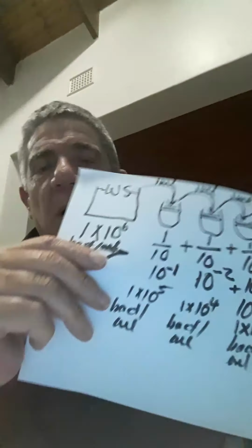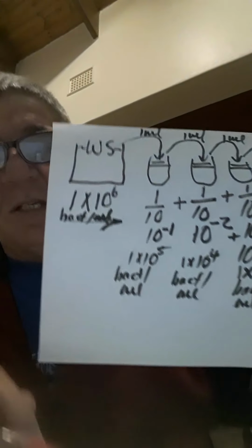Dear class, I'm still on this couple of pages as in the previous lecture, and also on pages 80, 81, 82, 83, 84, and that all had to do with the counting of bacteria. Now let me tell you, as I said in all my other videos, there's no technique that is 100% accurate. And I want to show you why we need dilutions. You will wonder, what is going on on this page of mine? But I'm going to explain to you, it's actually very simple.